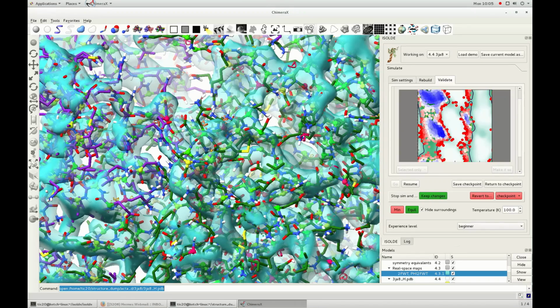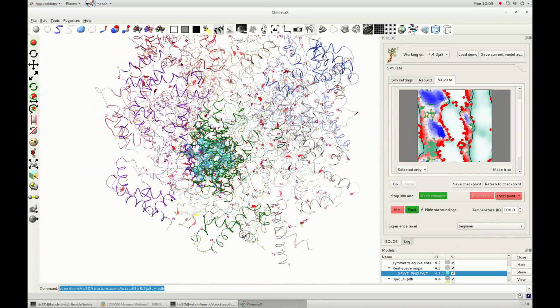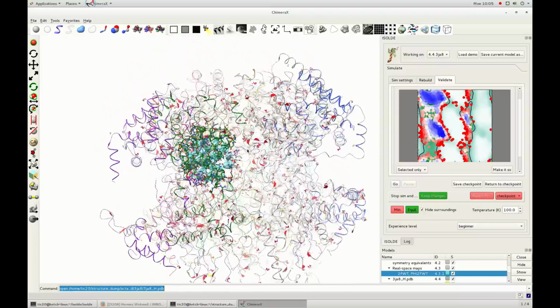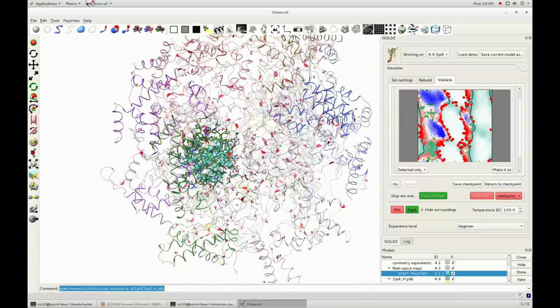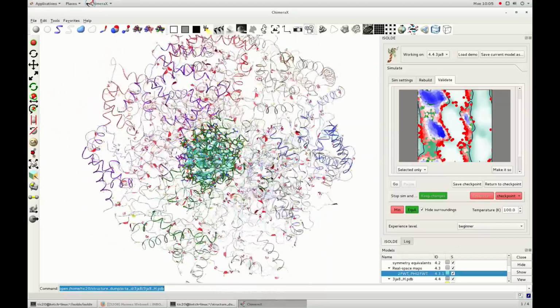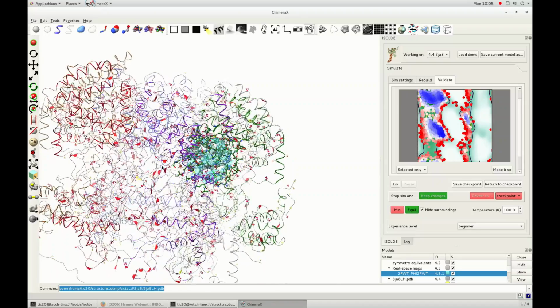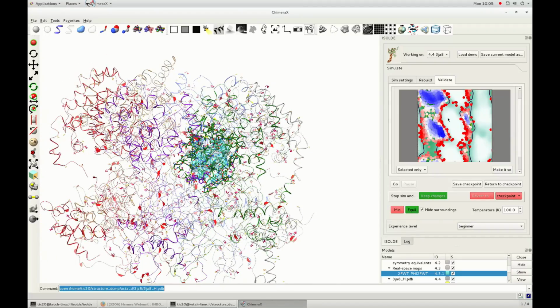Clicking the green Keep Changes button stops the simulation and reverts to the standard scrolling display. The rotamer and cispeptide bond annotations from the simulation remain visible, and they certainly tell a story here. It turns out that this model has over 100 spurious non-proline cis bonds, and the number of rotamer outliers has increased from that seemingly perfect initial 0.1% to somewhere approaching 10% of residues.